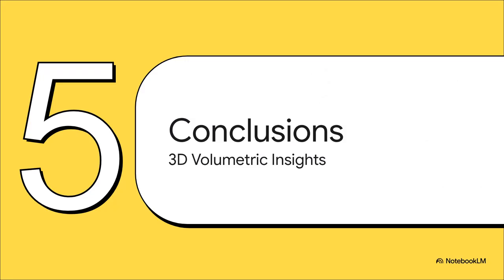And finally, Section 5, Conclusions of our 3D volumetric analysis. Through some really careful digital masking of the cuprous oxide particles in the 3D rendering, stereological measurements were able to isolate the newly nucleated grains. The data confirms that the representative volume of a single newly nucleated PSN grain is precisely 0.23 cubic micrometers, and it exhibits this fine, equiaxed morphology that's highly characteristic of rapid stored energy release.